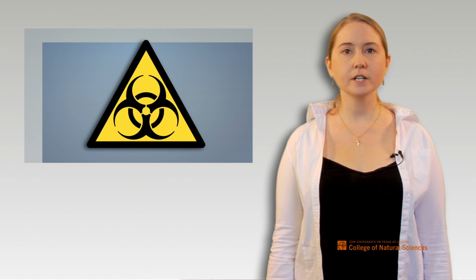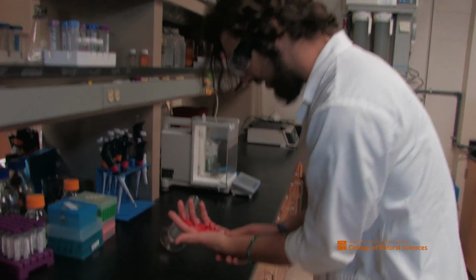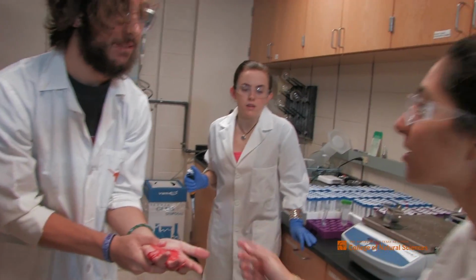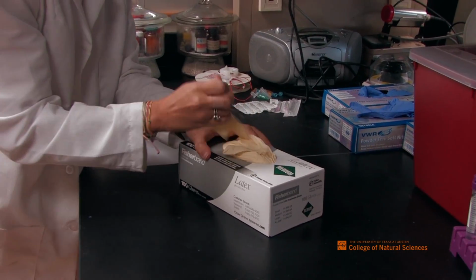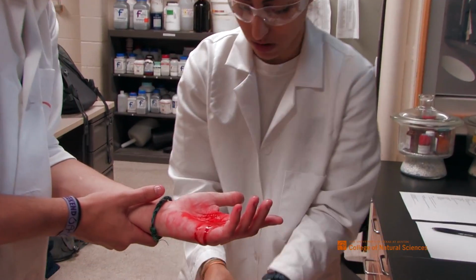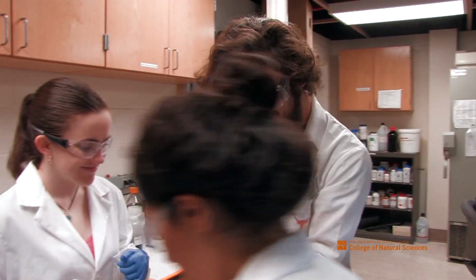If there is an injury or exposure in the lab due to a spill, keep others out of the area and immediately contact EHS for biological spill response. Blood is considered a biohazardous agent since it may carry viruses such as HIV or hepatitis B. EHS should be contacted for all biological spills, exposures, or other lab incidents involving biological materials, and they should be contacted even if you have already cleaned up the spill yourself.